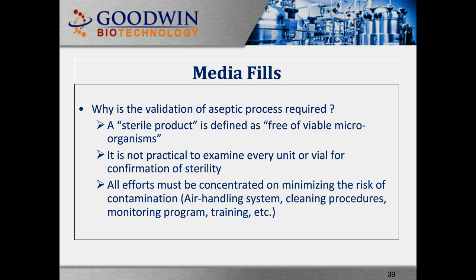Why is the validation of aseptic process required? What is a sterile product? A sterile product is defined as free of viable microorganisms. It is not practical to examine every unit or vial for confirmation of sterility, because biological drug products cannot go through 100% sterilization, as Jeff mentioned.